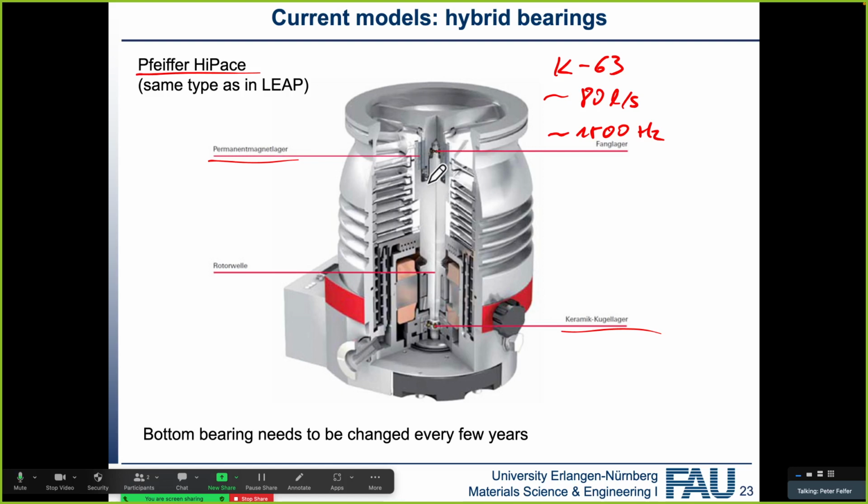There is one example of an atom probe at colleagues in France, on an air suspended table, because it was a laser atom probe. Someone put something too hard on the table, and exactly that happened. The turbo pump blew up and took essentially everything in the chamber with it. So be careful with turbo pump systems.